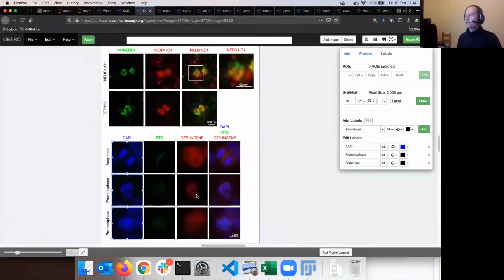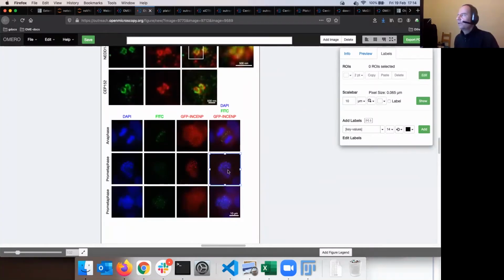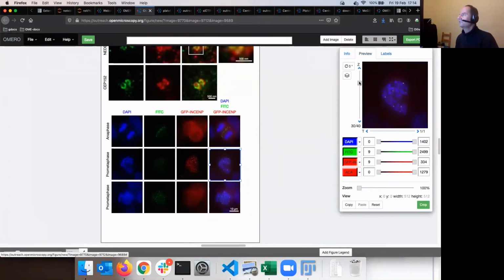So we are actually done with our workflow. You see how quickly I went through to show you how to create a figure. By the way, we can also, of course, go more fancy because we have a Z stack here. I can still scroll through the Z stack.